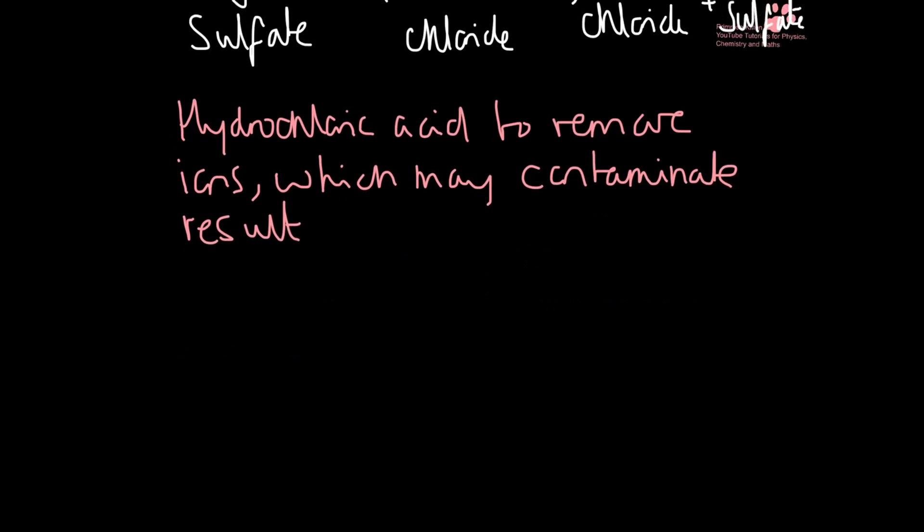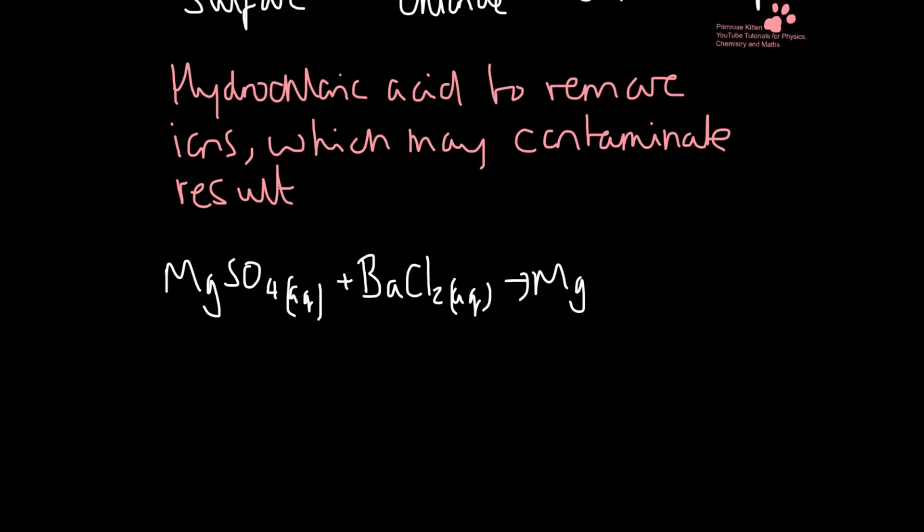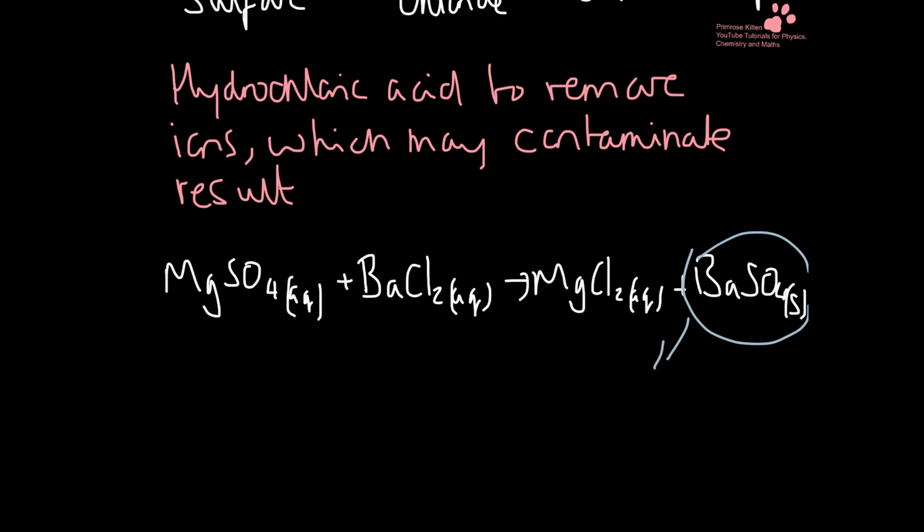So the reaction that we actually had happen was between the magnesium sulfate. And it's this one here that is cloudy — that's going to give us our white precipitate, which is evidence of sulfate ions being present.